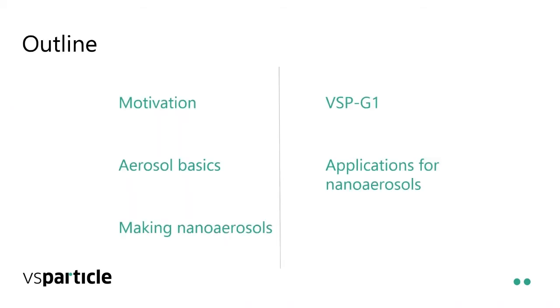So I'll give a bit of motivation about why I will talk about this, describe some aerosol basics, talk about how you could make nanoaerosols, then focus, of course, on the G1 a bit, and highlight a few applications where it's not so much the materials themselves, but the particles that we are interested in.